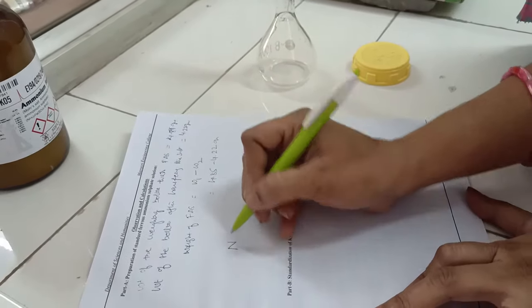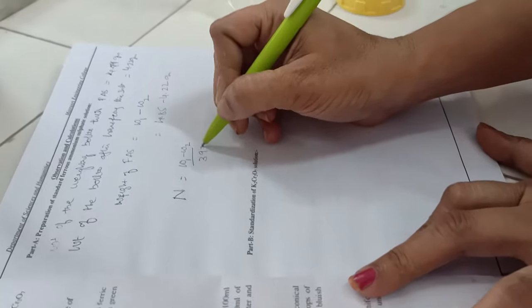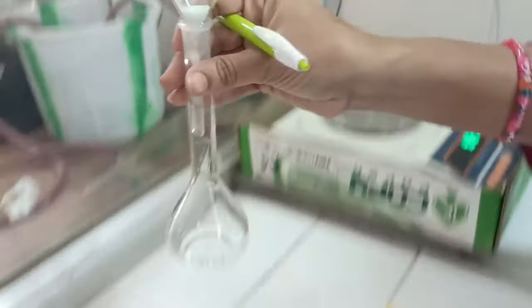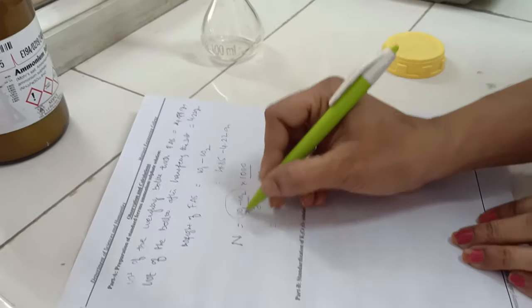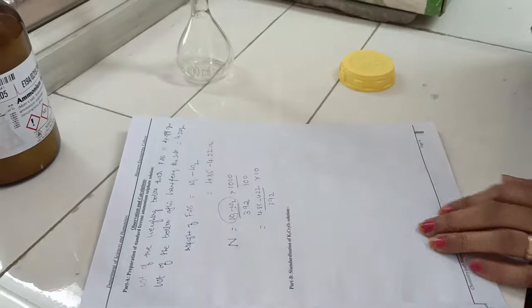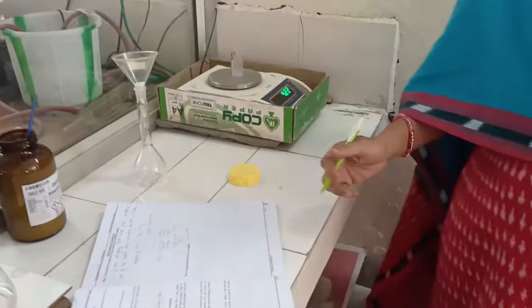The normality formula is: normality equals weight of the salt divided by its equivalent weight, which is 392, multiplied by 1000, divided by the volume in ml. This is a 100 ml flask, so the calculation is 4.85 minus 4.22 divided by 392, multiplied by 10. The result is the concentration of the ferrous ammonium salt solution. This completes the first step — preparation of the FAS salt solution.